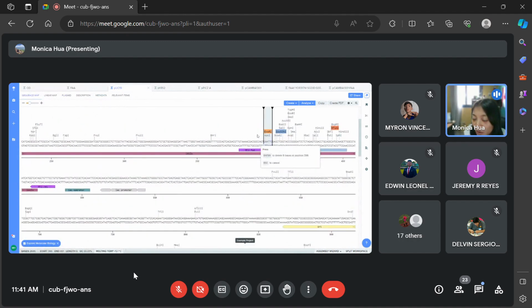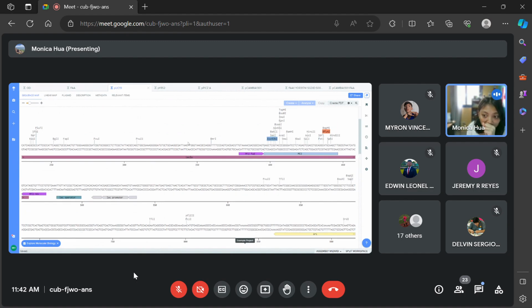All right. So this is my EcoR1 site, right? It is GAATTC. GAATTC is in between CAGT and GAGC, right? So I'm going to delete this site, okay? Make a mental note of where it's between because that's where we will insert our sequence. And we're going to press enter. Bam, EcoR1 disappears.